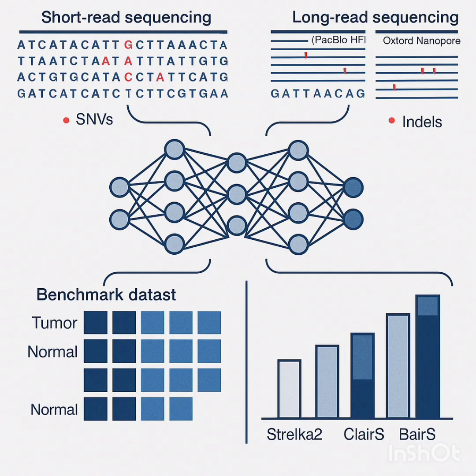Right. But they struggle where the genome gets complicated. Repetitive regions, structural complexities. Because the reads are short, just little bits of DNA. Exactly. If that little snippet is too short, it might look like it fits perfectly in, say, 5 different spots in a messy, repetitive region. Ambiguity. Right. It confuses the caller, leads to false positives, or worse, missed cancer variants.